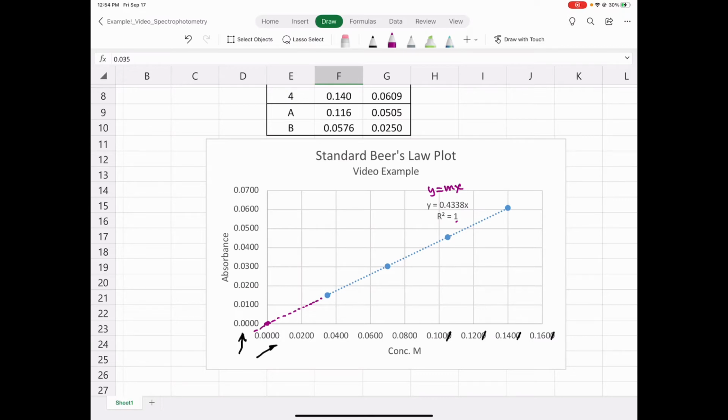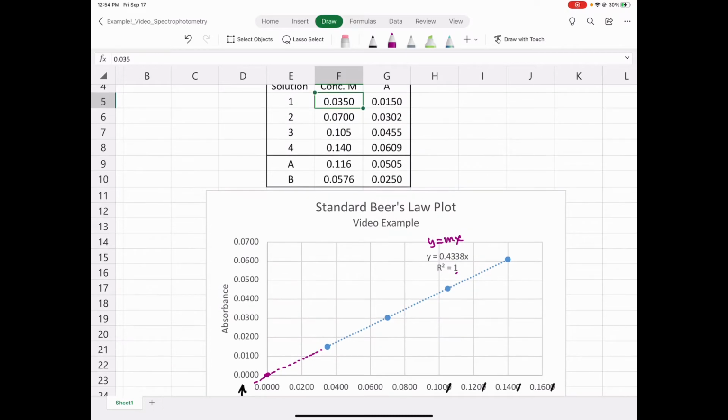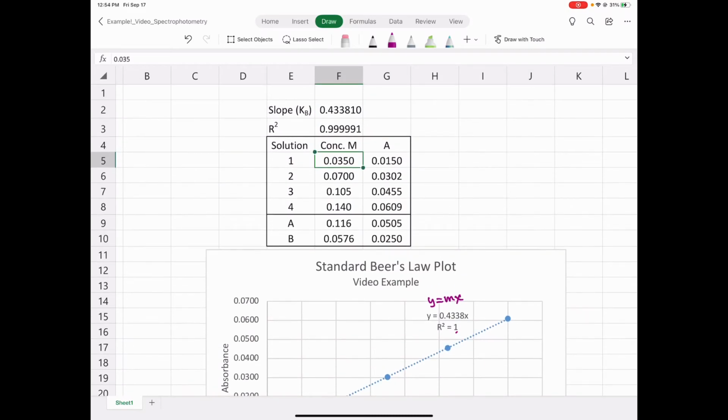I found the slope information that Excel gave me. This is the important information, and I actually typed it in as an equation, which is an equation that I had given you before. This is equal to LINEST. LINEST is a function in Excel that allows you to set the intercept to 0. You show your y values and your x values, comma, and then you put a 0. That means pass the line through 0, 0.